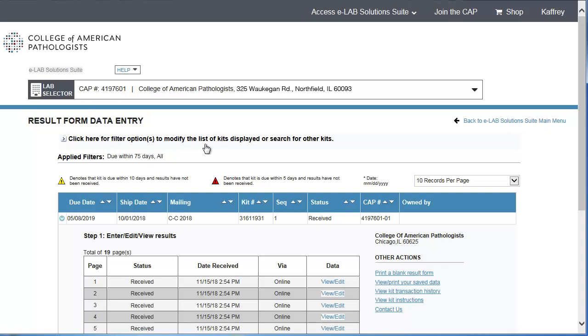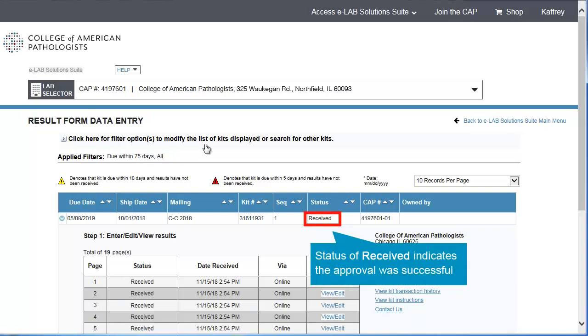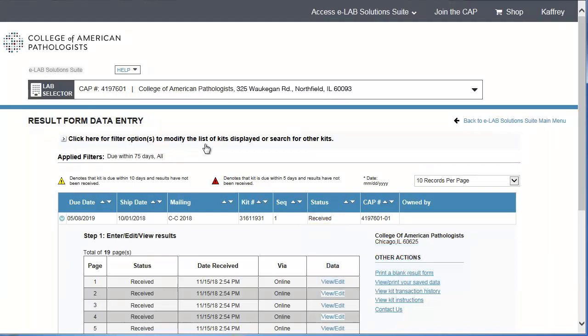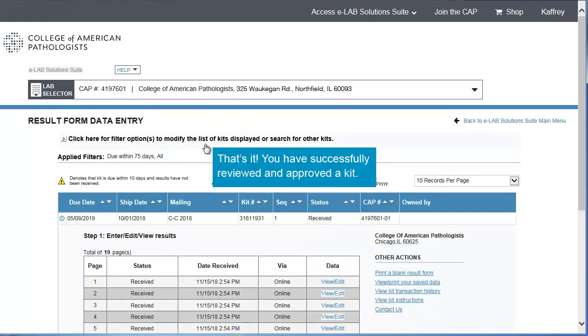If the approval is successful, the Result Form Detail Screen Status column will display Received for that kit. That's it! You have successfully reviewed and approved a kit.